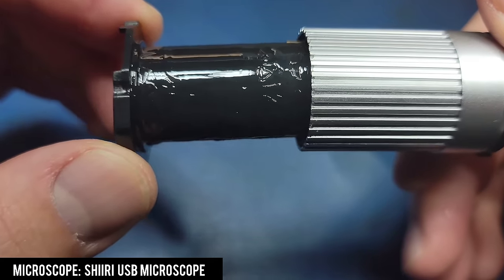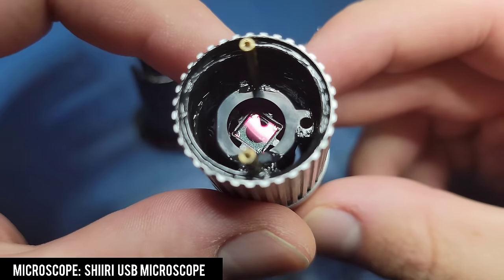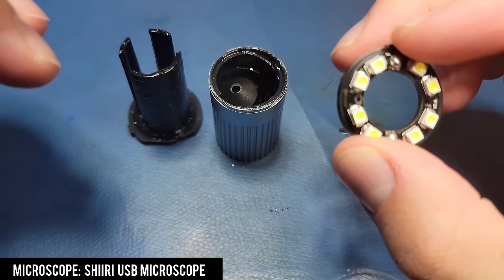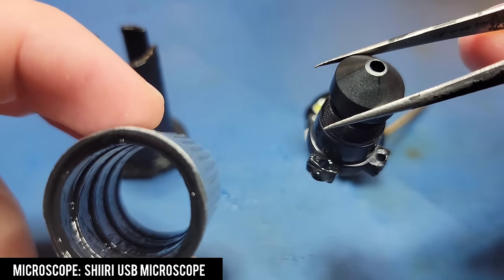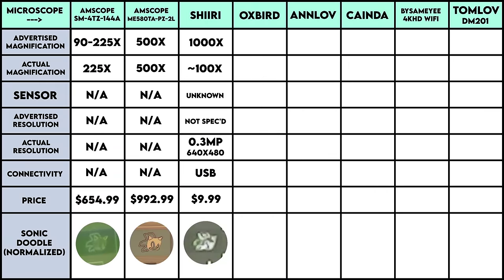Since this microscope will no longer work I might as well finish the teardown completely. Two brass rods are used to bring power up to the LEDs on top of the microscope. The microscope is filled with grease which allows the center lens assembly to screw up and down with the help of a plastic insert. Overall it's a very simple design for a very cheap microscope — in fact it's the cheapest at $9.99. We're not off to a great start performance-wise, and I have low hopes for the next microscope.